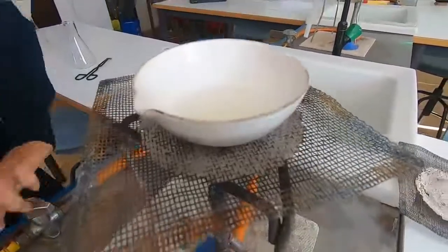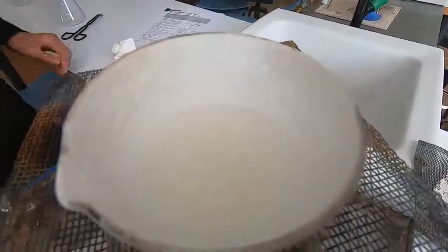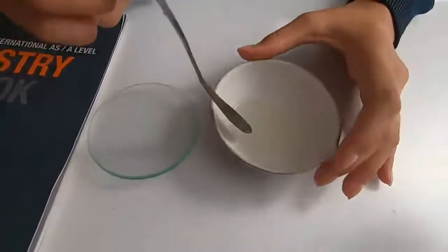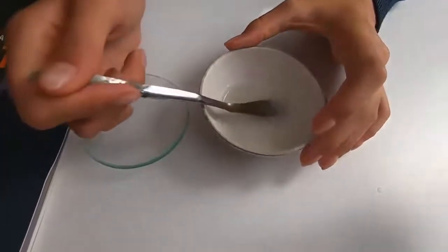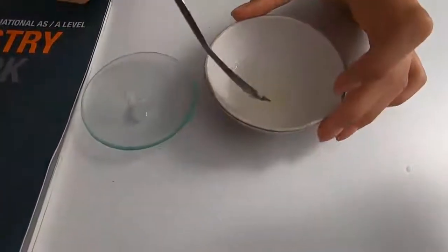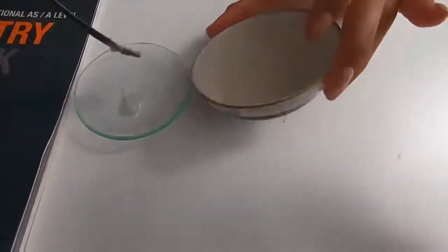Once the Bunsen burner goes off, at this point it's really quite hot so be very careful with the evaporating basin. You can see we've got the tongs there on the side so we can safely lower it down. After a while the crystals start to form, and if we leave it for a few hours the crystals will form quite nicely. We'll place a few of the crystals onto the clock glass.